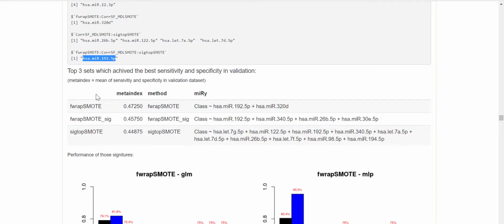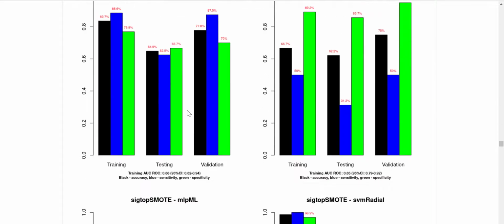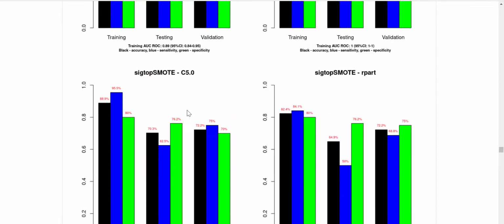There is also a third option in which we show the same metrics, but we are interested in the mean of sensitivity and specificity just in the validation set. This is of course optional, but can also provide additional insights into whether your features are working or not.